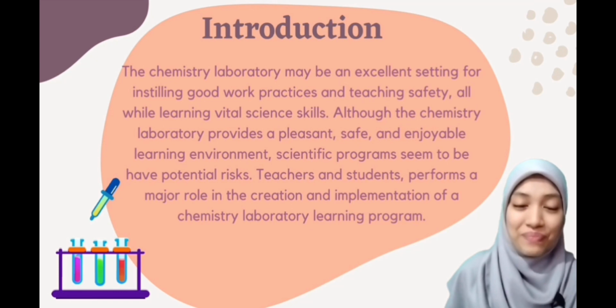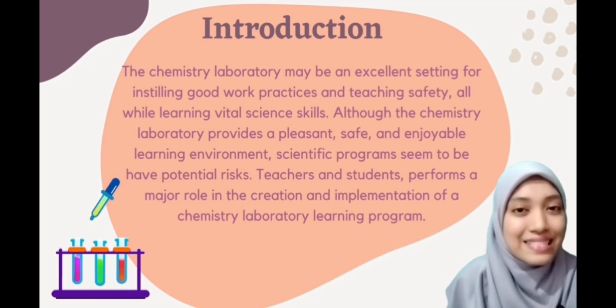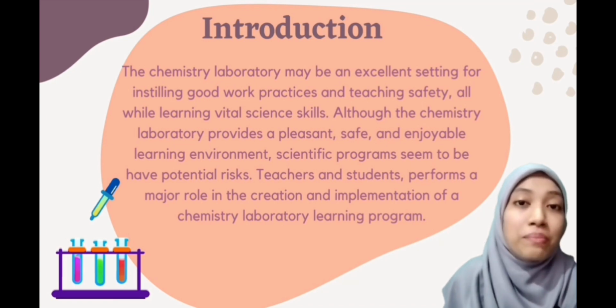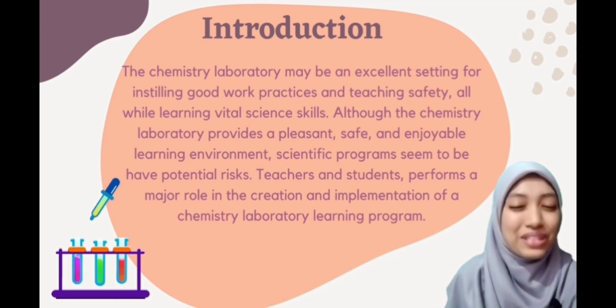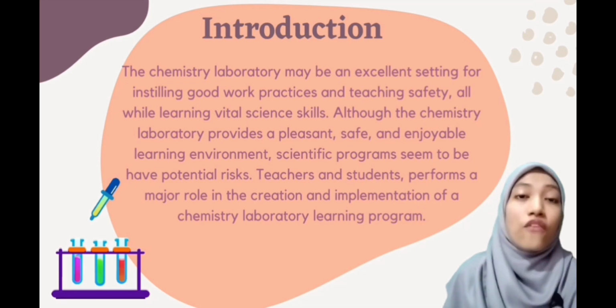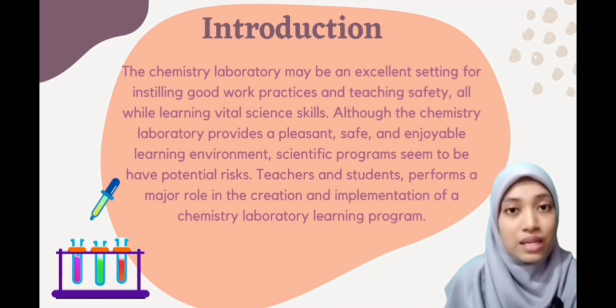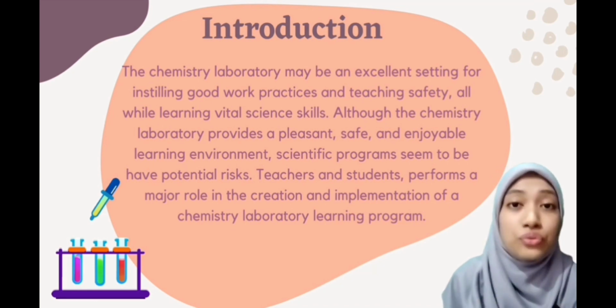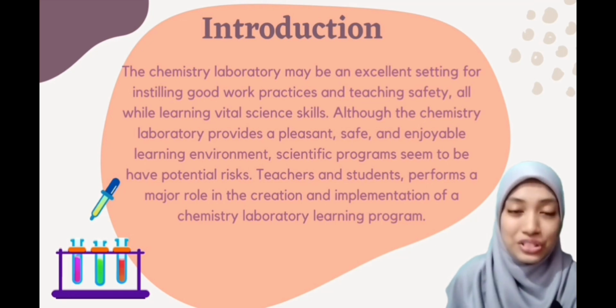The chemistry laboratory may be an excellent setting for instilling good work practices and teaching safety, all while learning vital science skills. Although the chemistry laboratory provides a pleasant, safe, and enjoyable learning environment, scientific programs seem to have potential risks. Each of these groups, which are teachers and students, must perform a major role in the creation and implementation of a chemistry laboratory learning program.